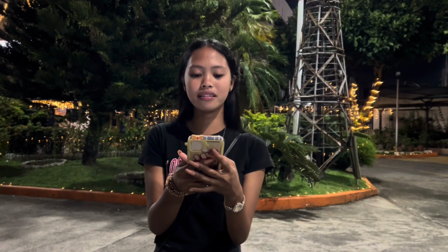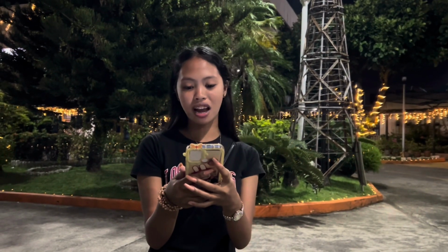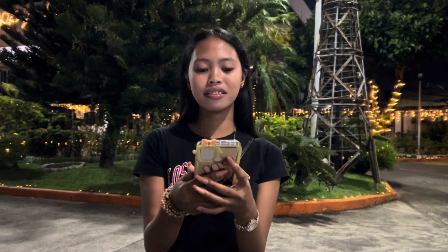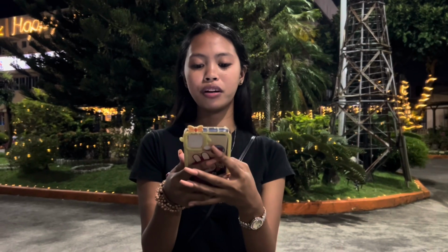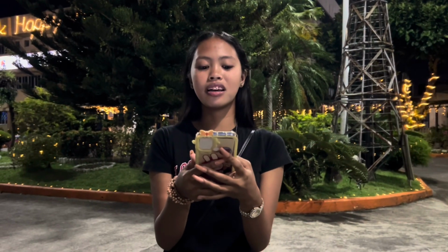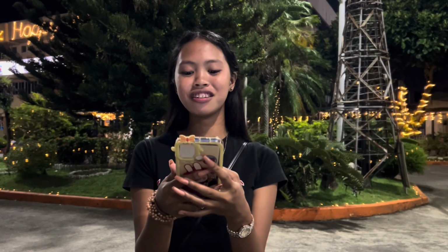A thermometer is an instrument that measures temperature. It can measure the temperature of a solid such as food, a liquid such as water, or a gas such as air. The three most common units of measurement for temperature are Celsius, Fahrenheit, and Kelvin. The Celsius scale is part of the metric system.